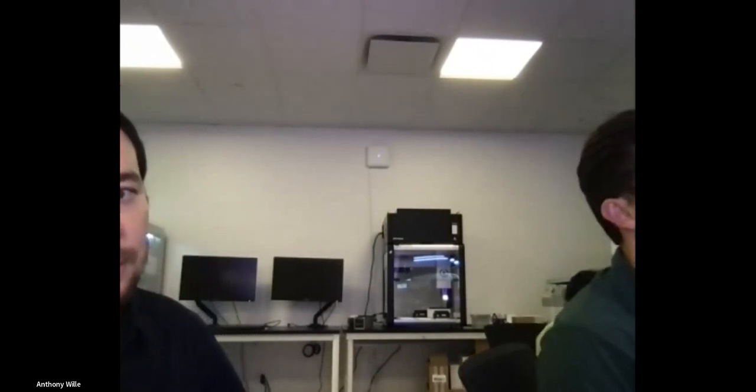Maybe Jesse, you could just point out where those additional tip racks would go, as we see the deck. If you can see our deck view here of the machine, we have tip racks loaded onto our device. Over here on this side, part of the reason the gripper is on the extreme right-hand side of the gantry is that there's a whole area over here that the gripper can reach that can't be accessed by pipettes. This area gives us 4 more staging slots where we can add tip racks or whatever it is that we need to move into the deck to perform higher and higher throughput protocols.